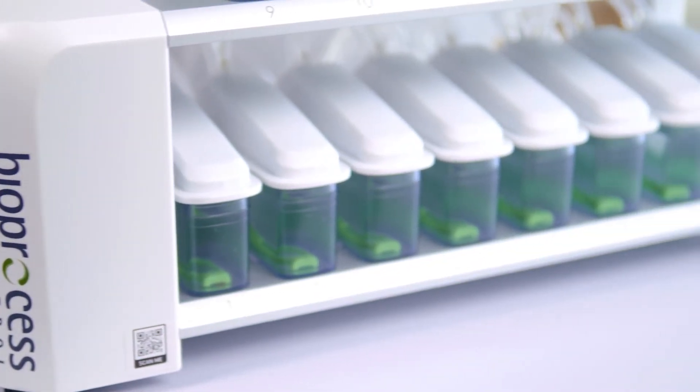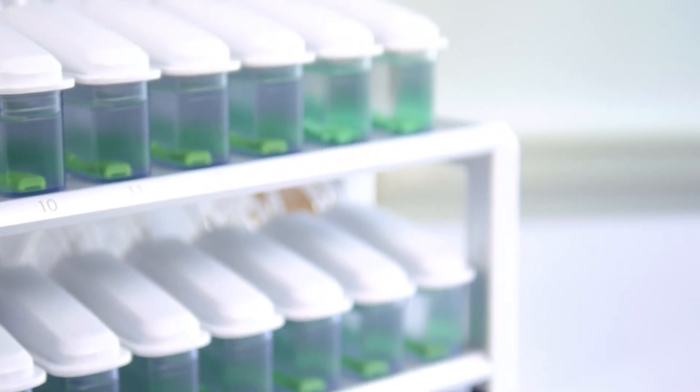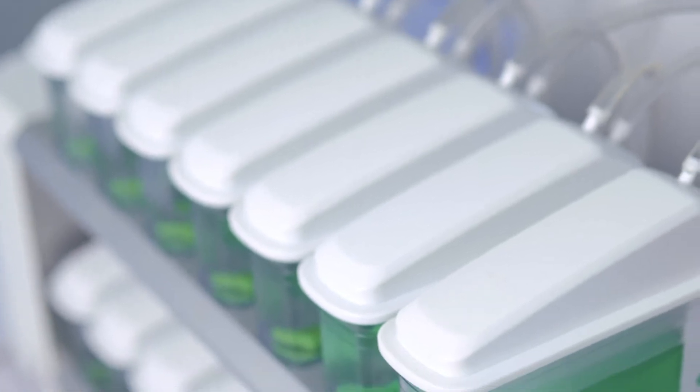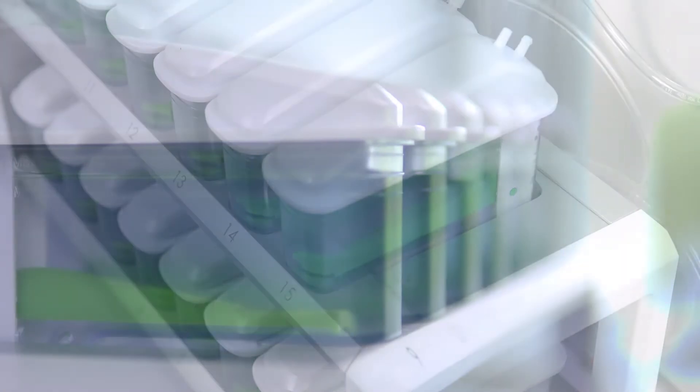The last part of Gas Endeavour is the detection unit. It is here where the gas is recorded and processed. The detection unit consists of 15 flow cell units that come in either 2 or 9 ml resolution. Temperature and pressure are recorded for each measurement and used to present the gas volume at standardized conditions. The flow cell unit's enclosed design ensures that even soluble gases can be measured with high accuracy.